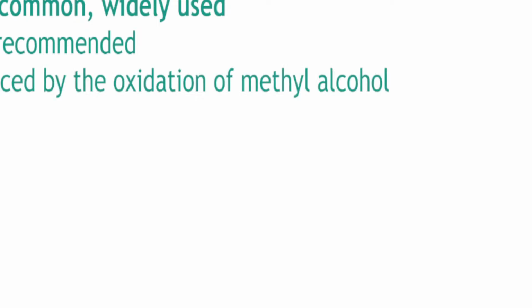Okay? Now, let's start with the fixatives one by one, starting with aldehyde fixatives. So obviously, we're going to discuss formaldehyde. Formaldehyde is most common and widely used. Okay? Widely used pa, hindi wildly. Hindi nag-wild class, widely used. Okay? It's 10%. The recommended concentration is 10%. And it's produced by the oxidation of methyl alcohol.